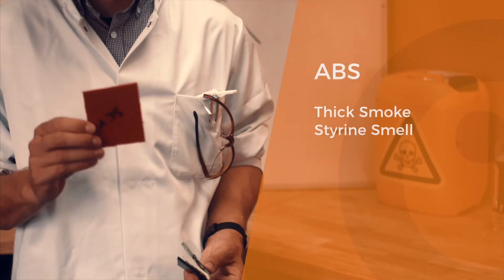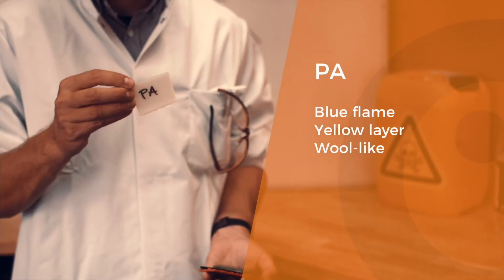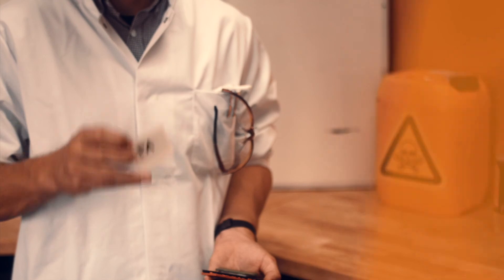ABS's flames will also result in a thicker smoke and soot. PA generates a blue flame with a layer of yellow similar to burned horn or wool.